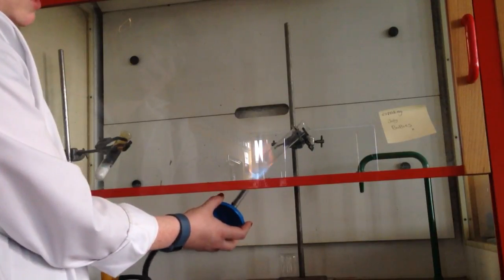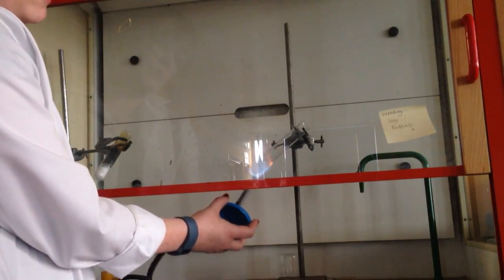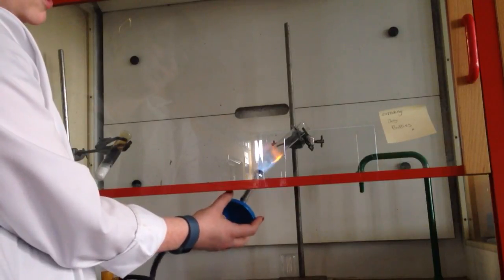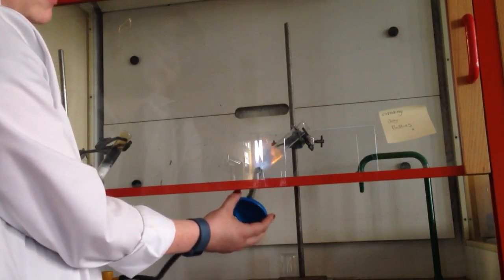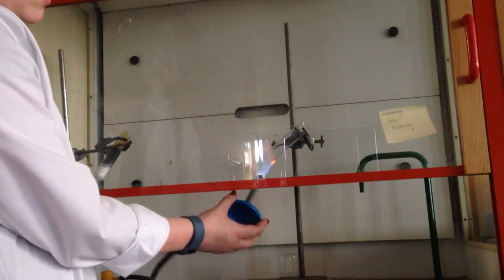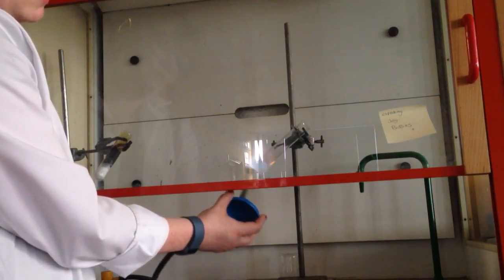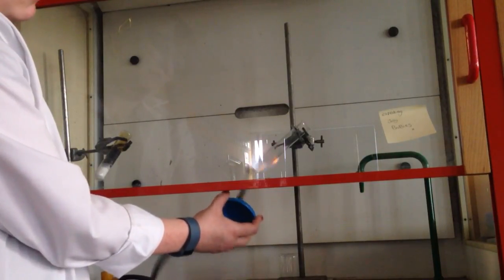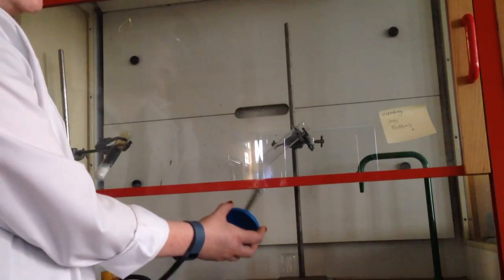The potassium chlorate here provides our oxygen and the jelly baby provides the sugar and once I've got this nice and liquid I'm just moving this around while I'm heating it up so that it doesn't char or get too hot in one place.